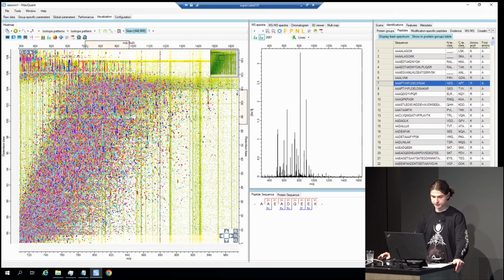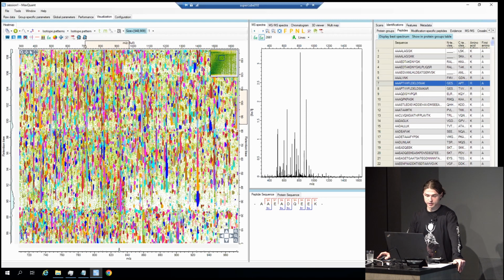And now you can see that in the upper part of the picture and on the right, there is a box that shows at which section of the whole range of values available for us we're currently looking. Here is the whole range, and this section is colored.